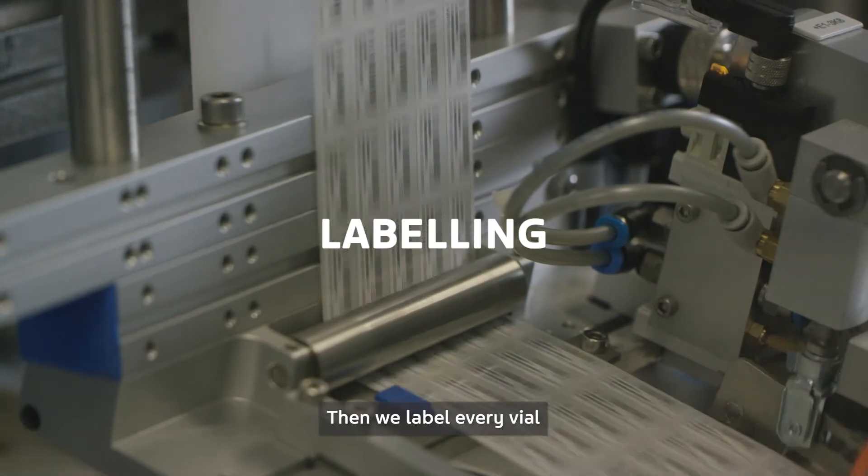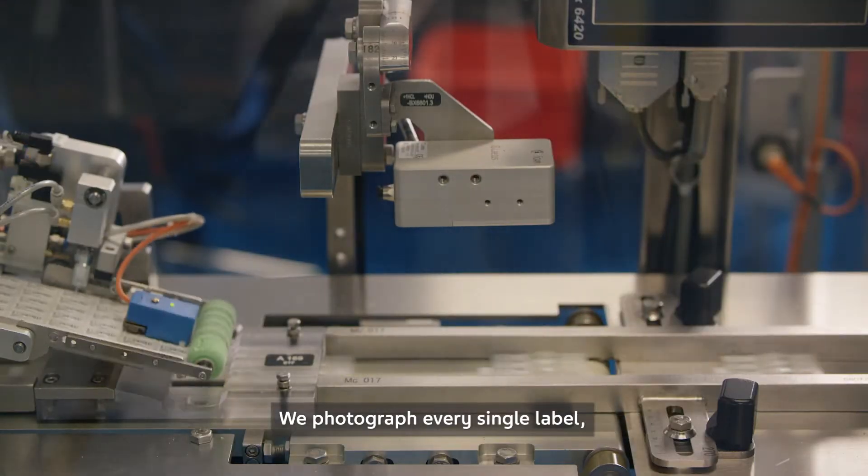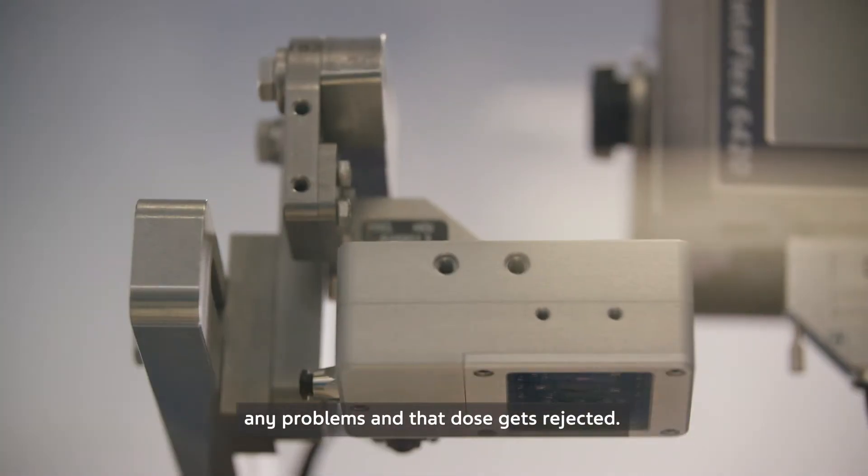Then we label every vial so the patient or the person giving the medication knows what's inside. We photograph every single label, and if there are any problems, that dose gets rejected.